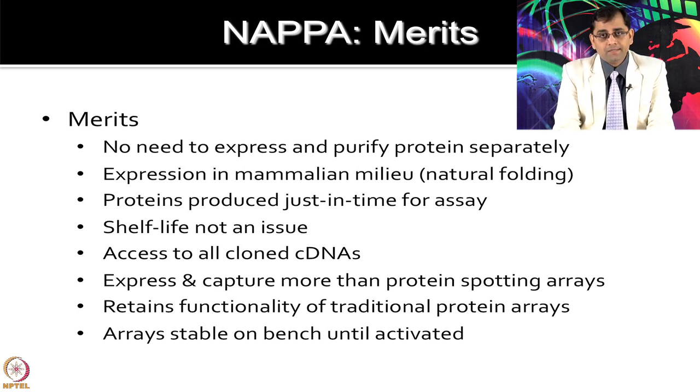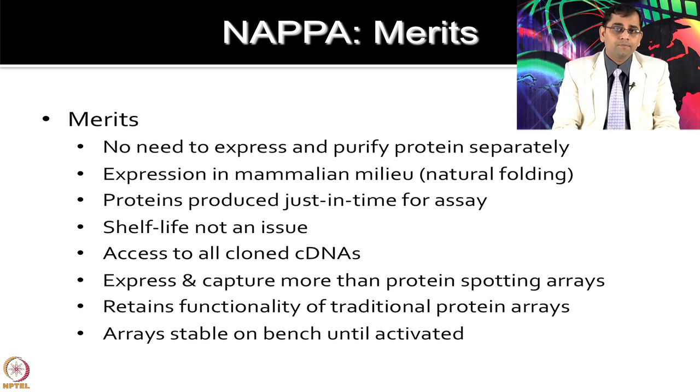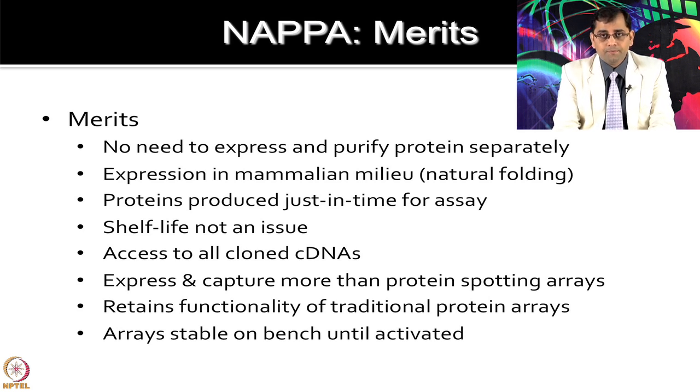Protein production can be just in time for the assays to happen. Since you are producing the protein on the same day when you want to do the experiment, you are definitely storing the chips which only have the DNA, and those are very stable chips, even at room temperature. Now, the day when you want to do your assay, your experiment for biomarker discovery or protein-protein interaction studies, on that day you are going to express the protein. So, shelf life is not going to be any issue.